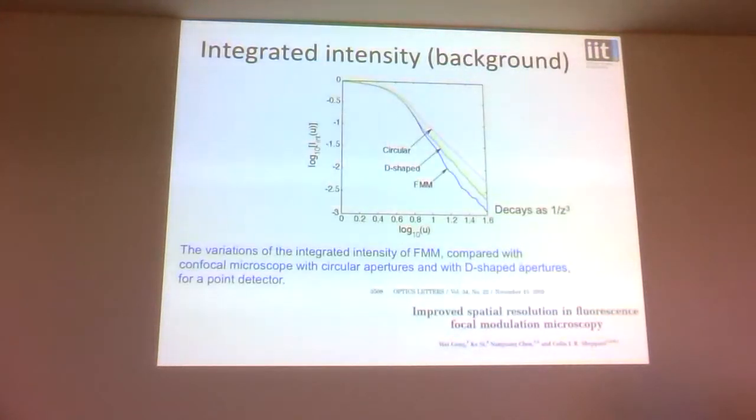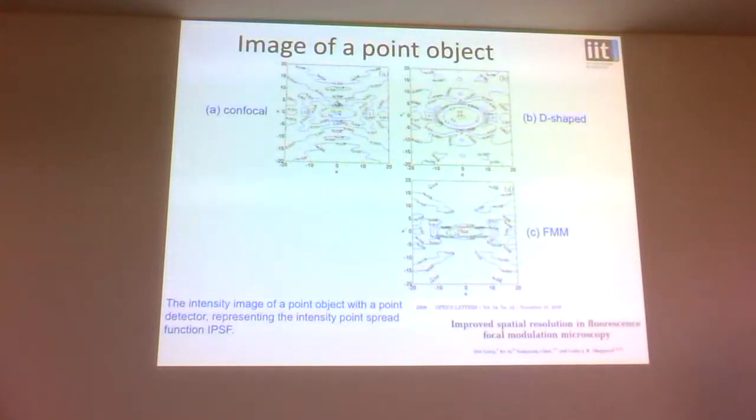What is the trade-off? Sorry, what is the trade-off? What do you mean by that? What are we losing? Yeah. Good point. You said numerical aperture because you used only half.